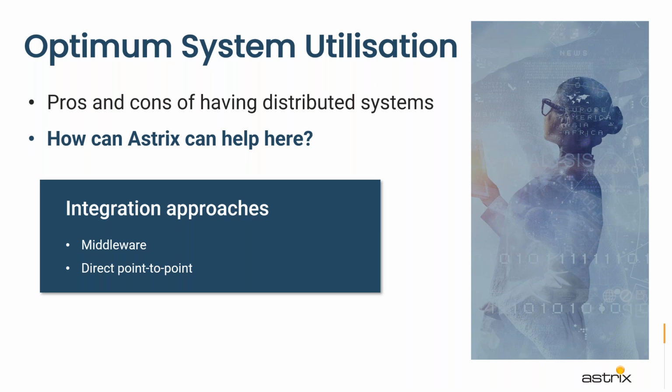It's different for the big machines like a Waters chromatography instrument that's tied to the CDS running on that linked PC that I mentioned a minute ago. This kind of thing, just like a mass spec, could be integrated to your LIMS or other similar technology using the vendor's API. That's just one way to do it.